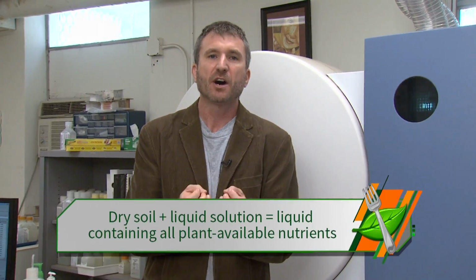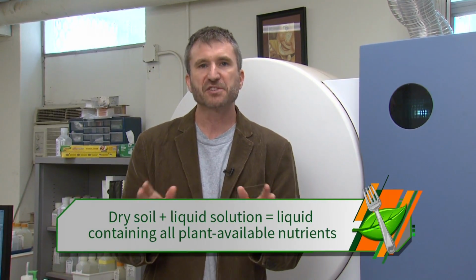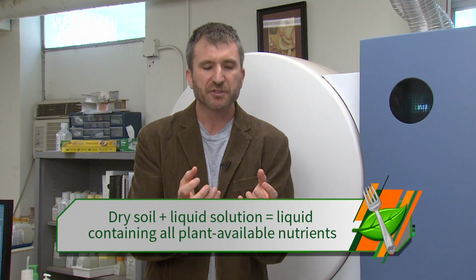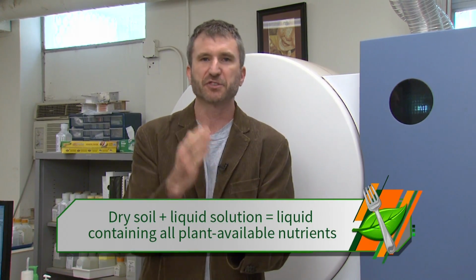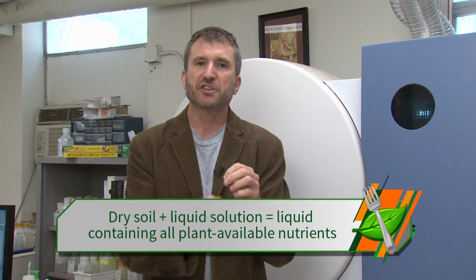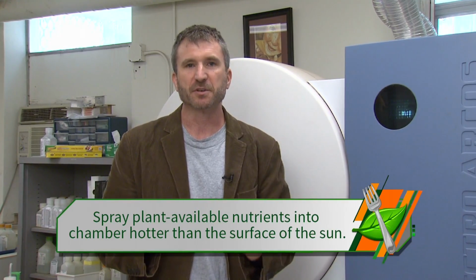First, they take some of that dry matter of the soil sample. That's just dry matter. Then they're going to mix it with some liquids, a solution. And what that solution is going to do, it's going to take all of the plant available nutrients, from phosphorus to potassium to copper to everything, and extract it from the dry matter, such that when you filter out the liquid, it has all of the plant available nutrients that was once in the dry matter of the soil. Then that liquid is going to come to this machine and it's going to be sprayed as a fine mist into a chamber.